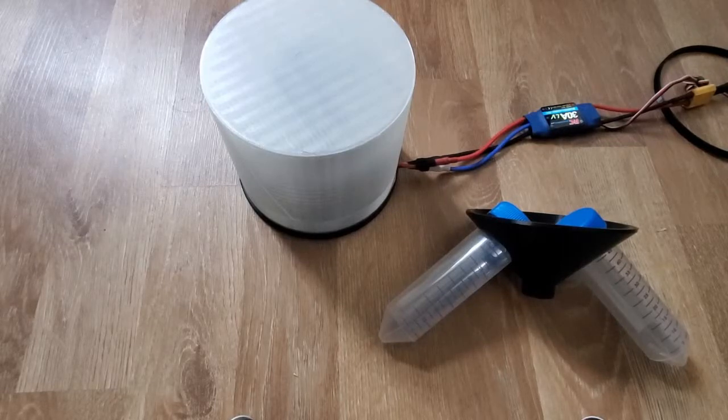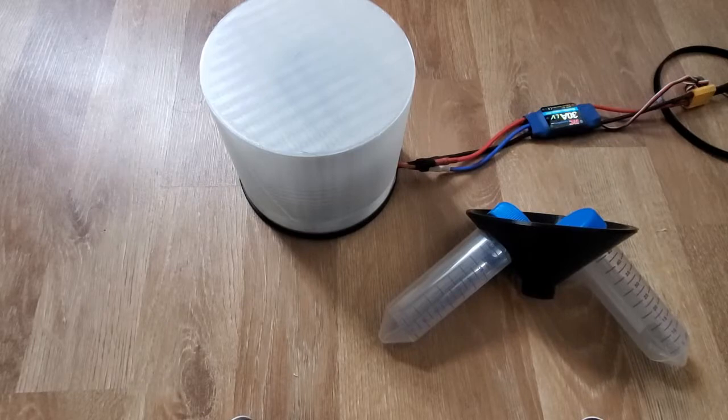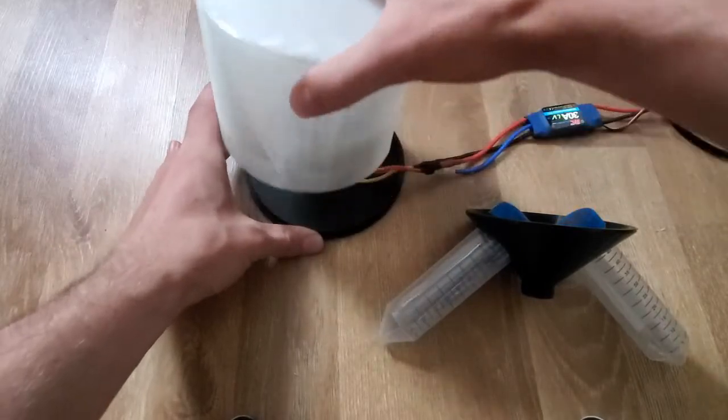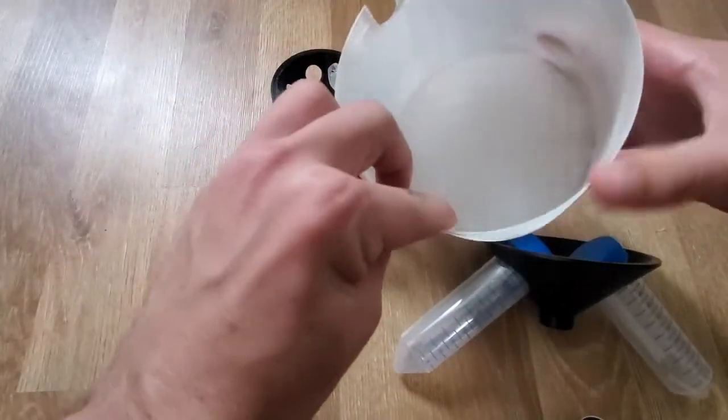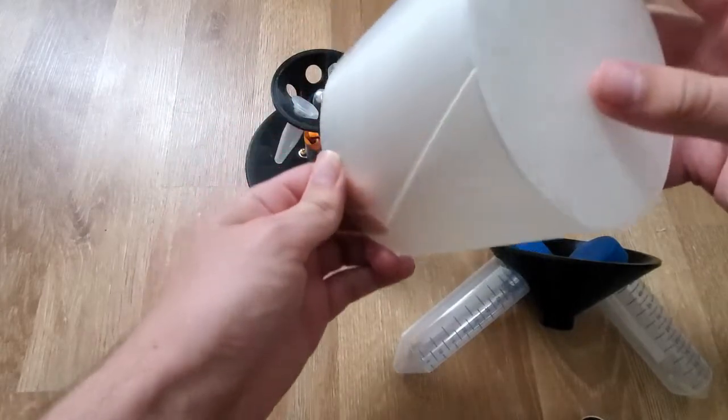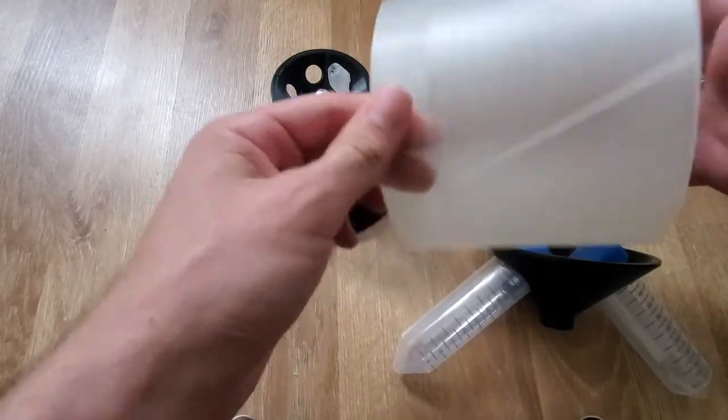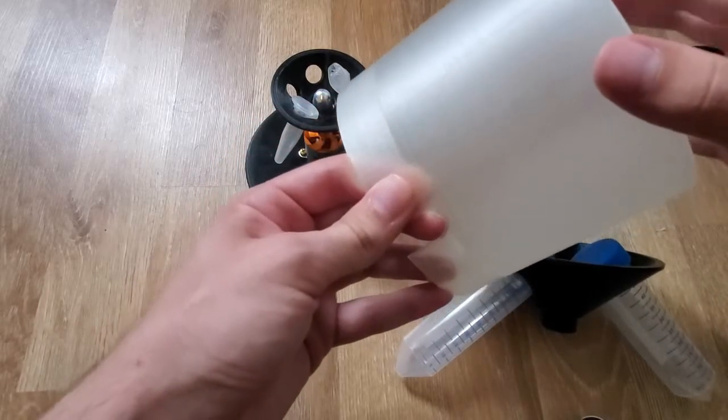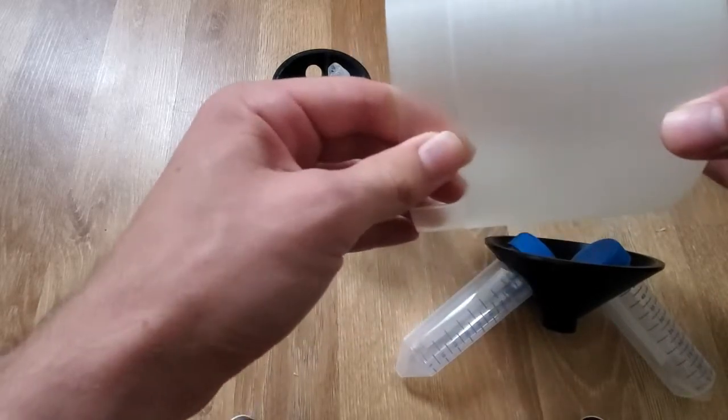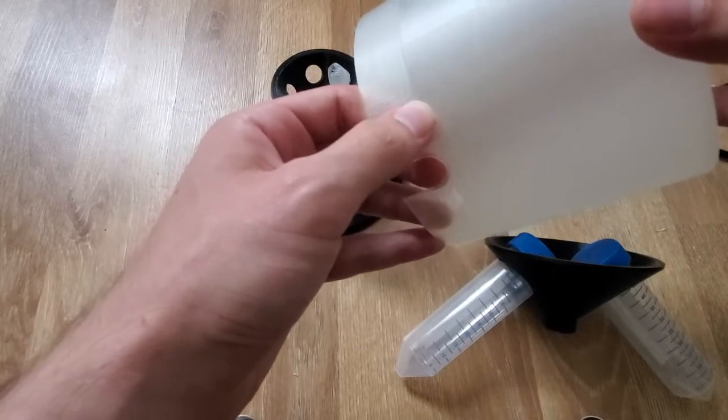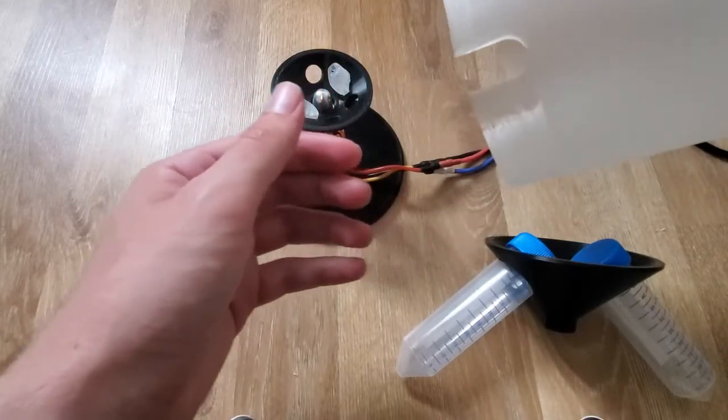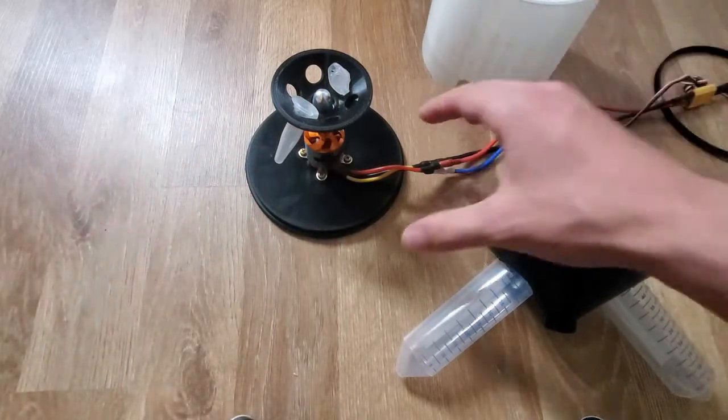These are the 3D printed parts that I put together to make the centrifuge functional. You've got the lid - I had some other designs originally, but this was the easiest one to print. I still want to get the outside clear so you can see it better, but it does the job for protecting against shrapnel.